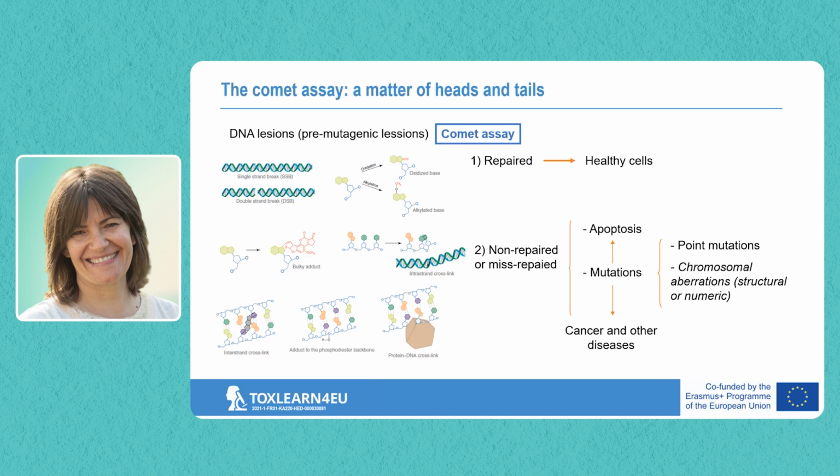What we are going to measure with the Comet Assay are these lesions. So they are lesions that can be repaired. We have other assays to detect mutations. Okay, I don't know if you are going to learn about them.